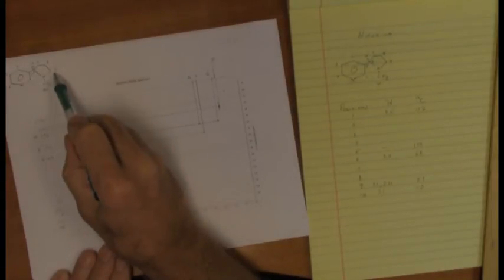And this is where the COSY is going to make its contribution to this effort. And this is where I'm about to stop with this and let you finish it up. But I do want to point out how you step from position 9 to position 8. We're going to need to go from here, which we now know, over to position 8. What we need to do is get the COSY spectrum. And there's our dear friend COSY. This one has the diagonal already marked. We haven't used it up to this point, but now we are.